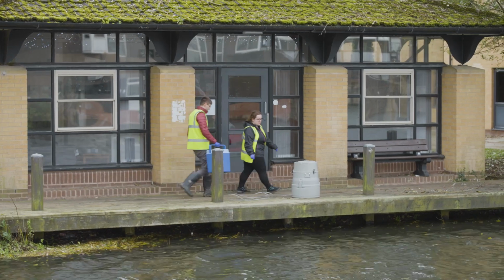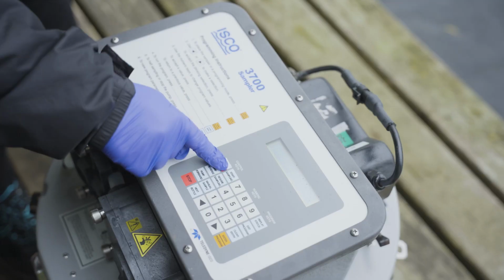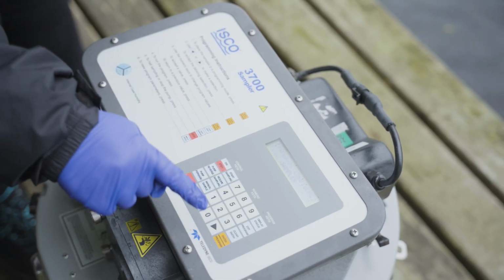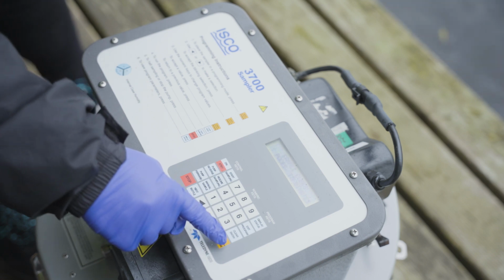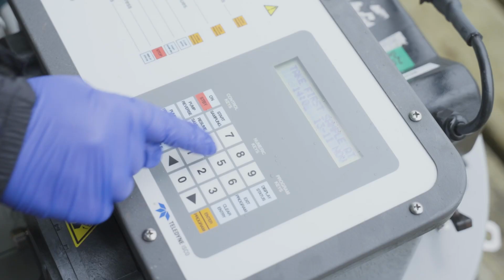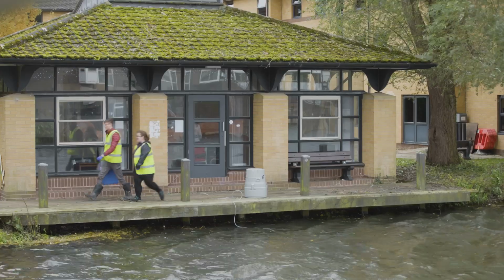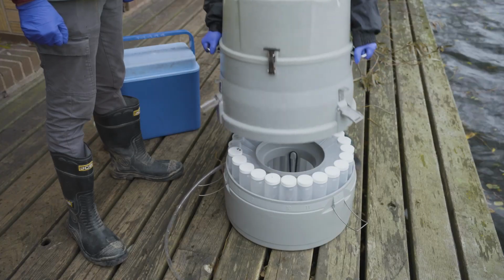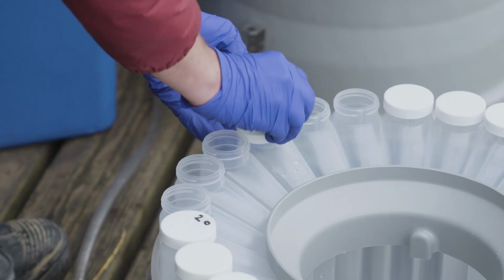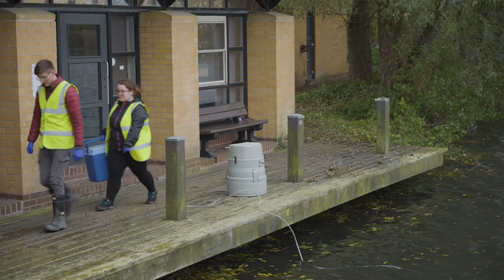An alternative method, depending on budget and access, is an autosampler, which allows you to take samples at high regularity. This approach is more likely to catch peaks of exposure. To use an automatic sampler, you must first connect it to a power supply or battery. Set the sampler to take the correct volume of samples at the times you desire, ensuring you have enough spare bottles. The time and date of your sample will be automatically recorded. An automatic sampler can also be used to collect composite samples. If sampling over a long period of time, check the equipment is working correctly and regularly maintained.